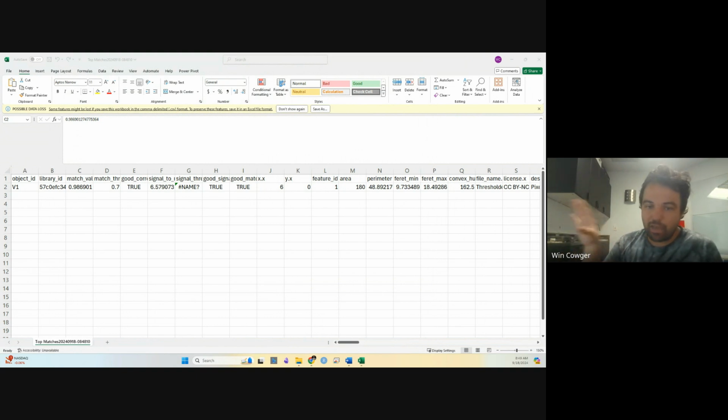That same approach that I just showed you, if you had 100 particles, 1,000 particles on your image, it would also work. But it's going to be a lot slower when you run a larger image. So just for brevity for this tutorial, I'm just showing you the single particle.